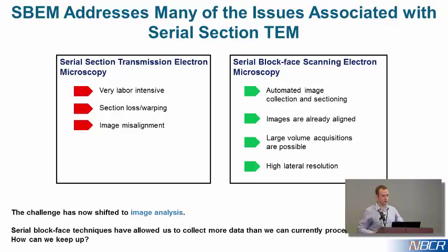And using some of the staining techniques that were developed in our lab, we're able to get images on the SEM that, unless you're a really highly trained microscopist, you won't be able to tell the difference between them and something coming off of a TEM. So we can still achieve pretty good resolutions. We can get pixel sizes around 3 nanometers laterally, and the cutting thickness can go down to 15 nanometers. Typically, we use, say, 30 to 60 nanometers step size in Z.